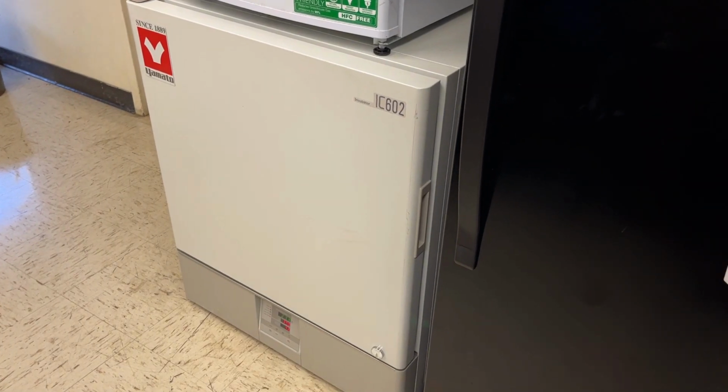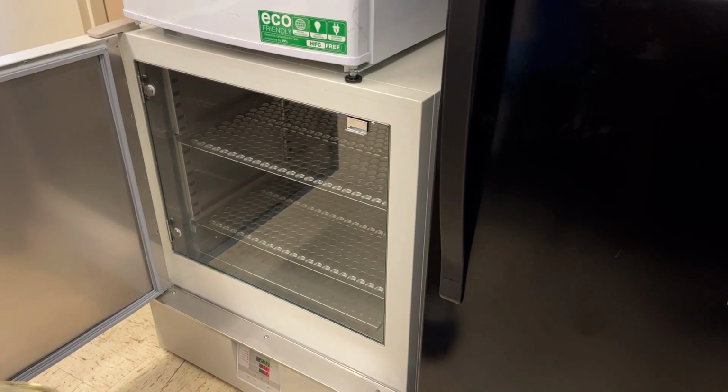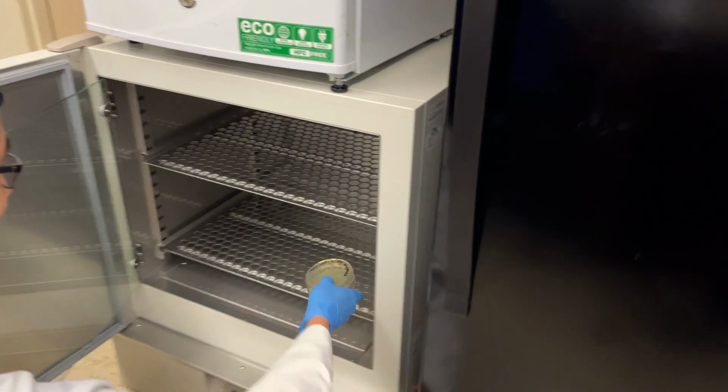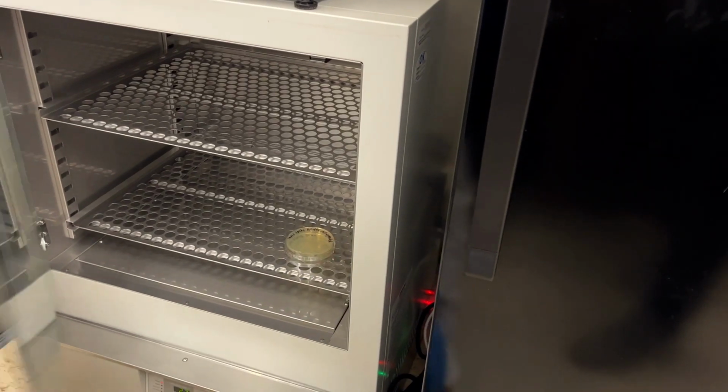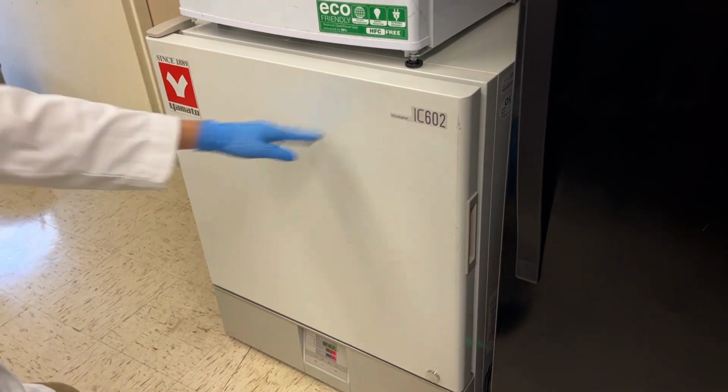These plates are now ready for incubation. Simply walk them over to the incubator, set at 37 degrees Celsius. Place your plates in there. Make sure that they are lid down, always lid down because of the condensation. And we'll see these tomorrow, crossing our fingers.